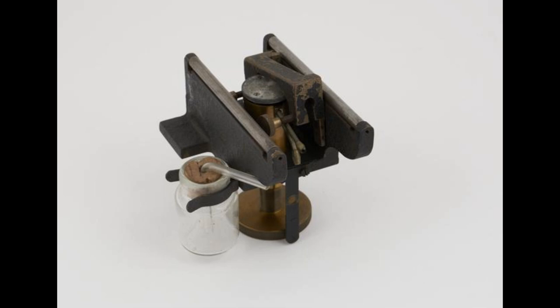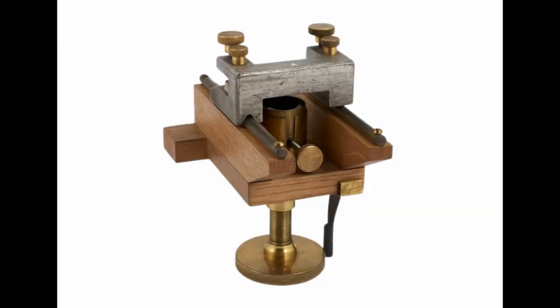A freezing microtome is designed to freeze a specimen so that it can be hard enough to be accurately sliced by the microtome without destroying it. The freezing microtome can utilize temperatures typically ranging from minus 60 degrees Celsius to zero degrees Celsius for freezing.